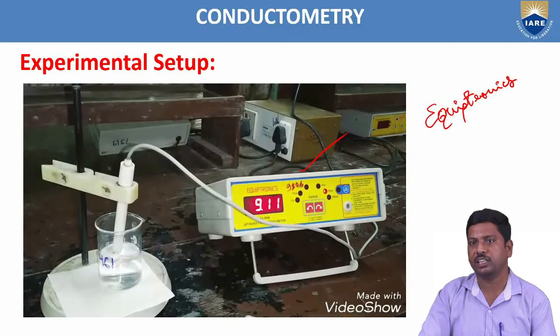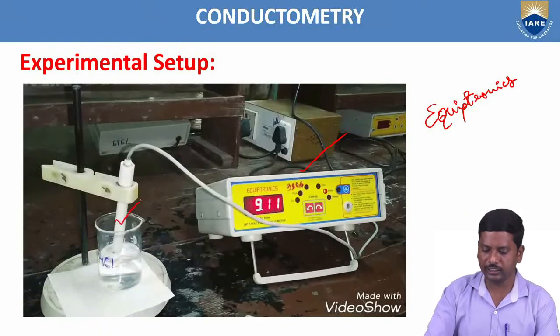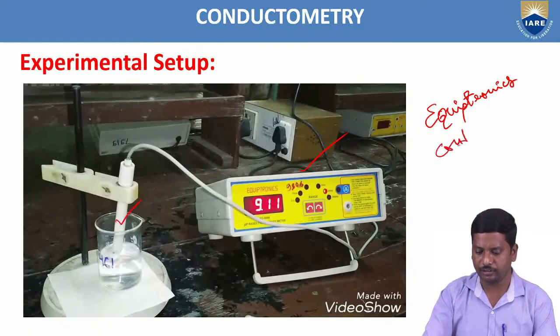Almost all the meters are made by this manufacturing company. It contains one glass electrode, called the conductivity cell.